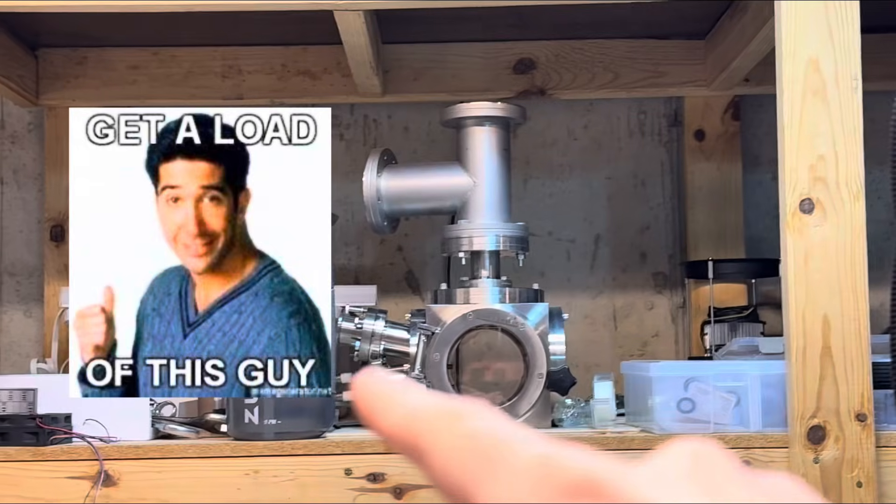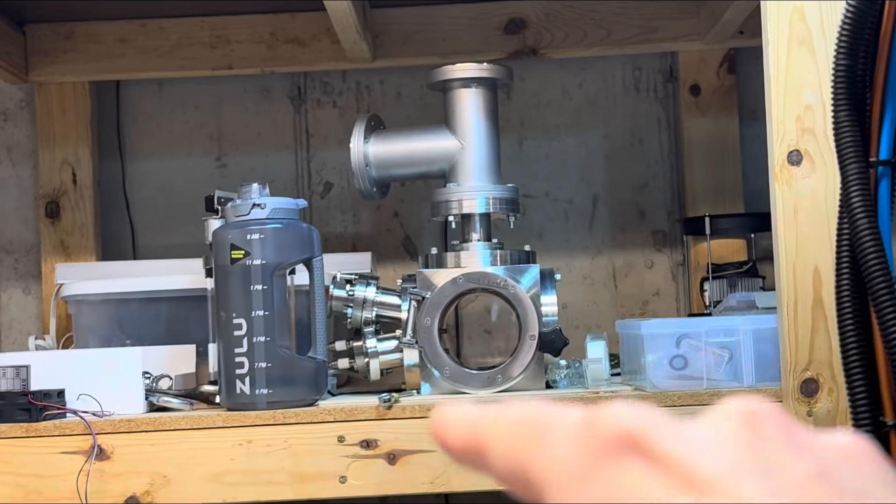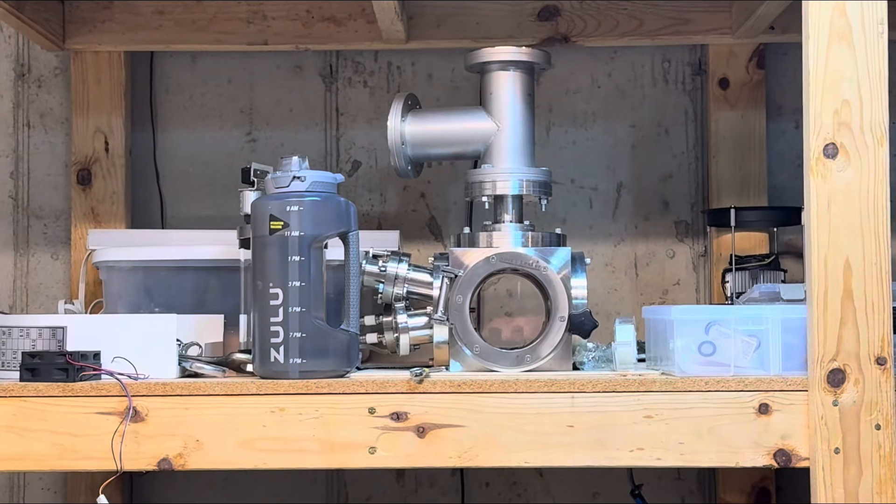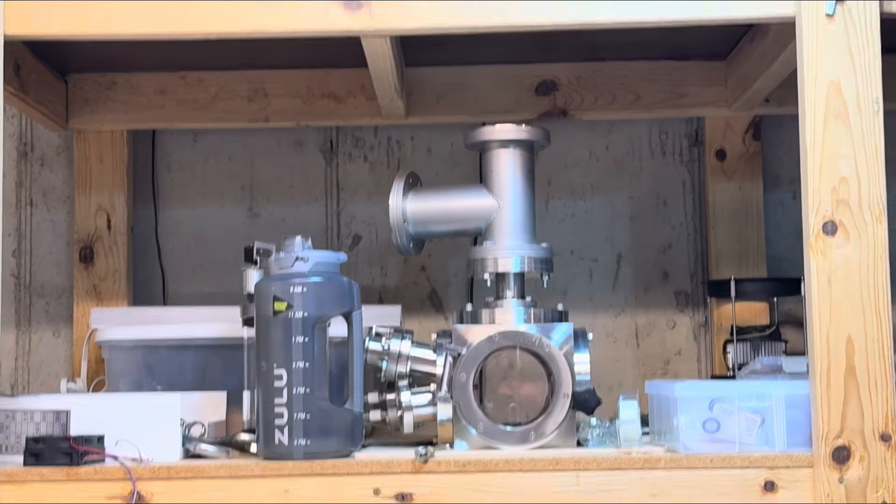Actually, get a load of this. So I got this whole chamber with everything on it. It was listed for $2,500, but it was waterlogged. So I talked the guy down to $250.